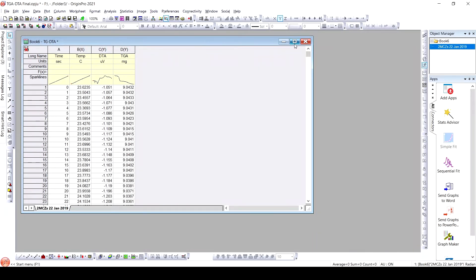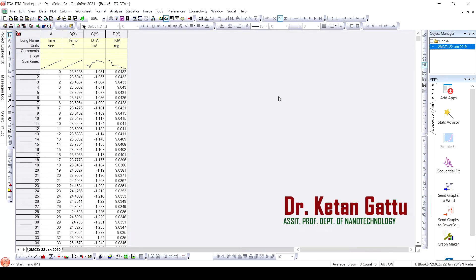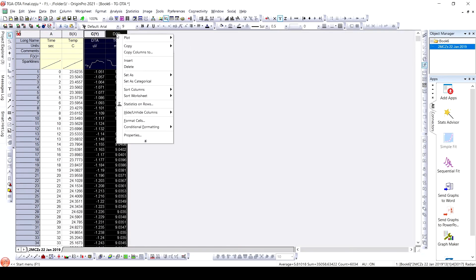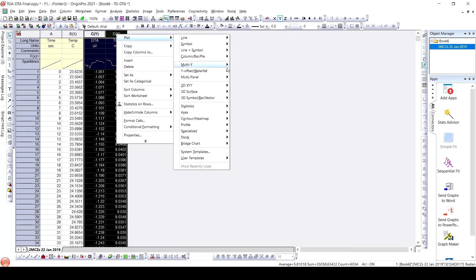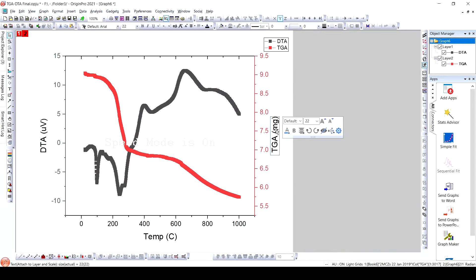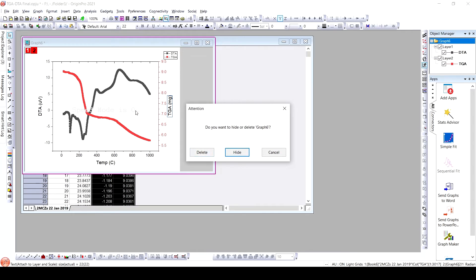Hello everyone. Yesterday we learnt to plot TGA and DTA data in OriginLab. This is a correction to the data that we plotted. The data we plotted was DTA and TGA. We used multiple Y or double Y to plot this data, and for TGA we used milligrams, but while plotting the data what we need to do is plot percentage weight. That is the change we will learn today, and we will also learn to calculate the percentage change in the TGA data.